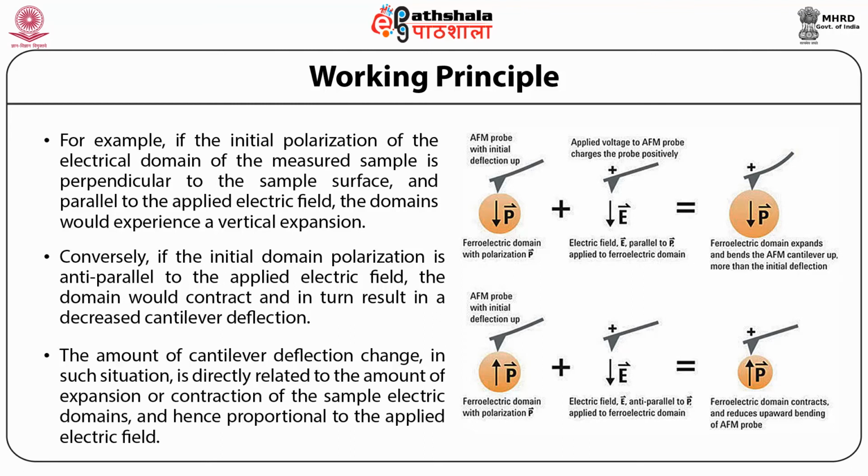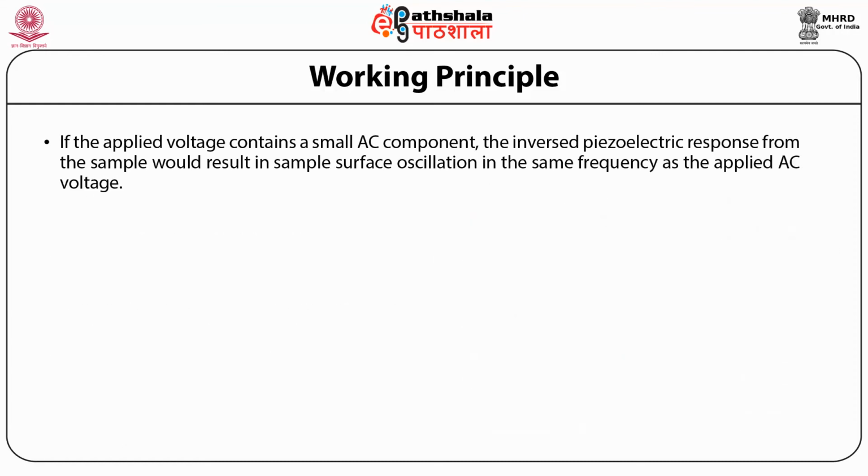So, the amount of cantilever deflection change in such a situation is directly related to the amount of expansion or contraction of the sample electric domains and hence proportional to the applied electric field. If the applied voltage contains a small AC component, the inverse piezoelectric response from the sample would result in sample surface oscillation at the same frequency as the applied AC voltage.